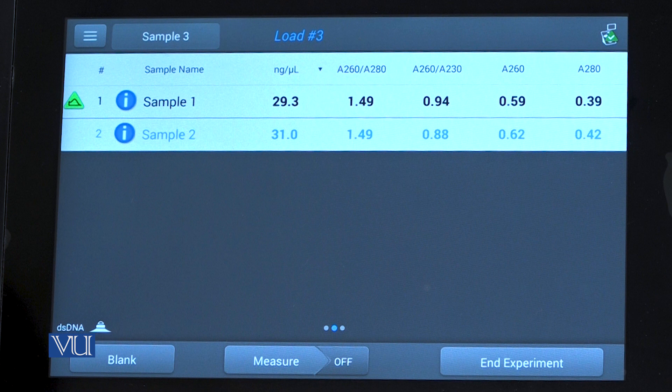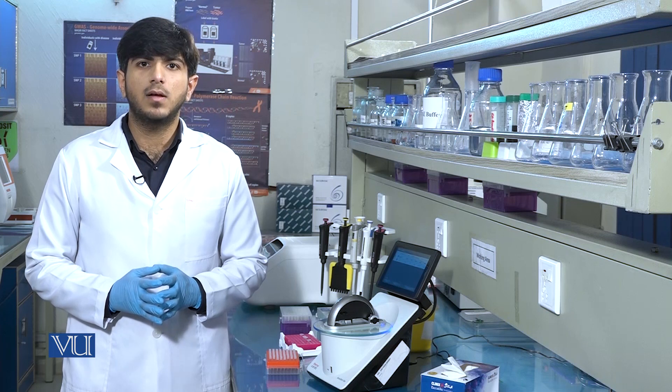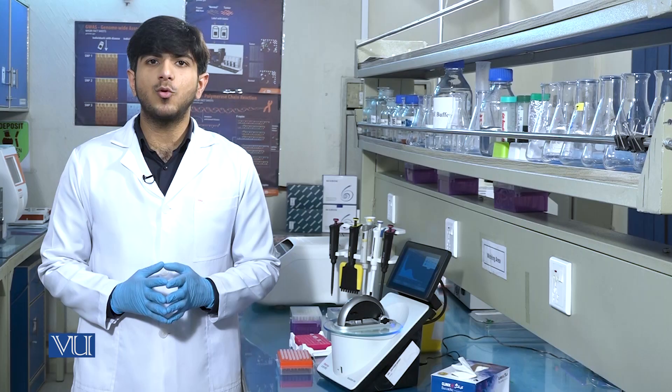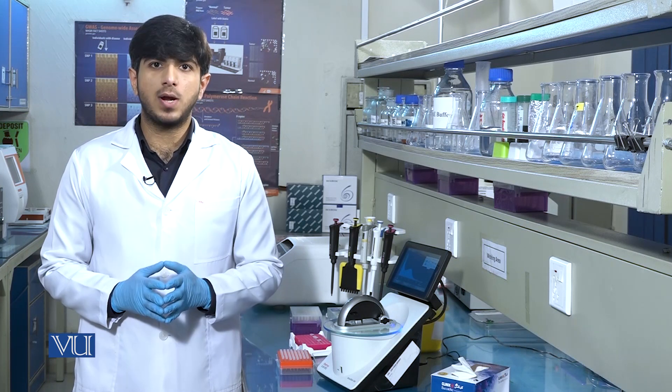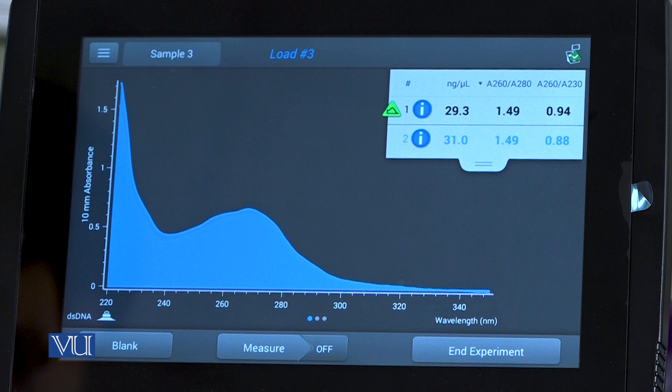These other ratios show the presence of contamination in the sample. Normally, there can be three types of contaminants in DNA: phenol, guanidine, and protein. If the value of the A260/280 ratio is 1.8, it shows that the sample contains pure DNA. In these results, there is contamination of phenol or proteins, which illustrates how we can assess contamination through the NanoDrop spectrophotometer. That is how we run multiple samples to measure the quality of DNA.